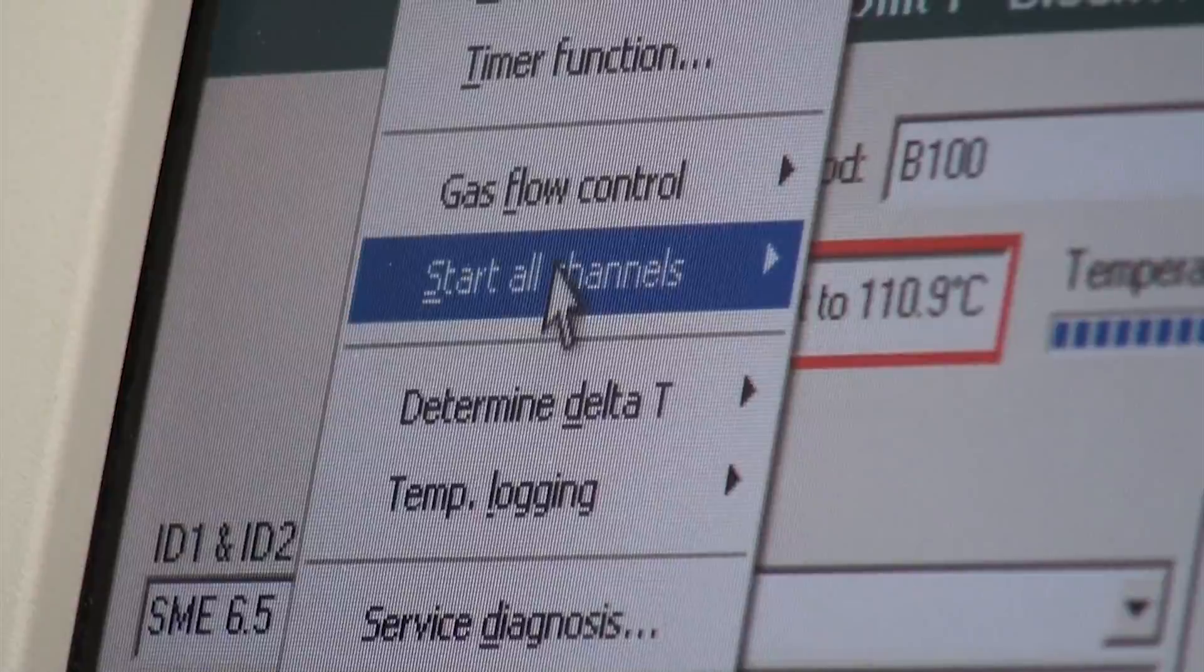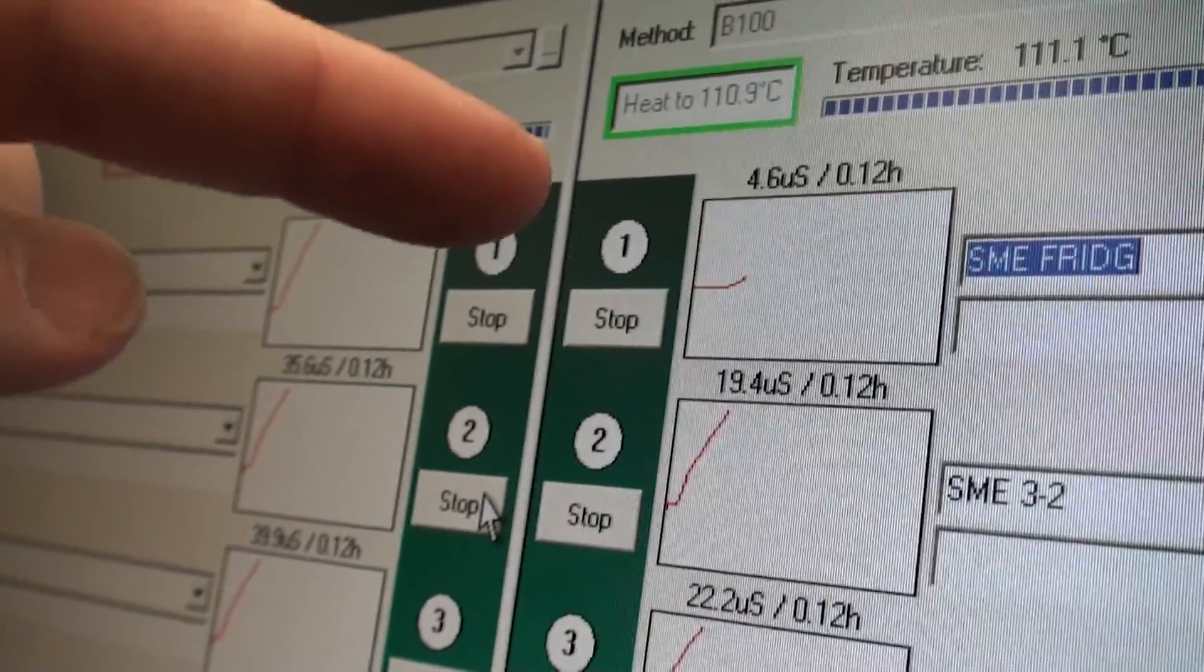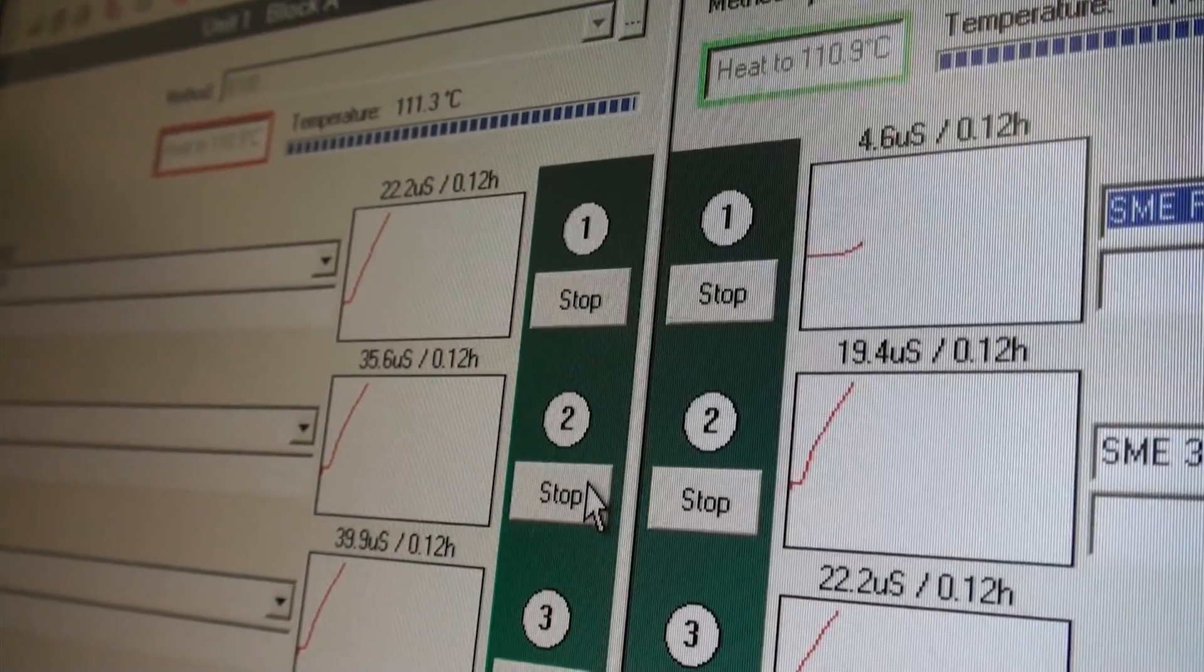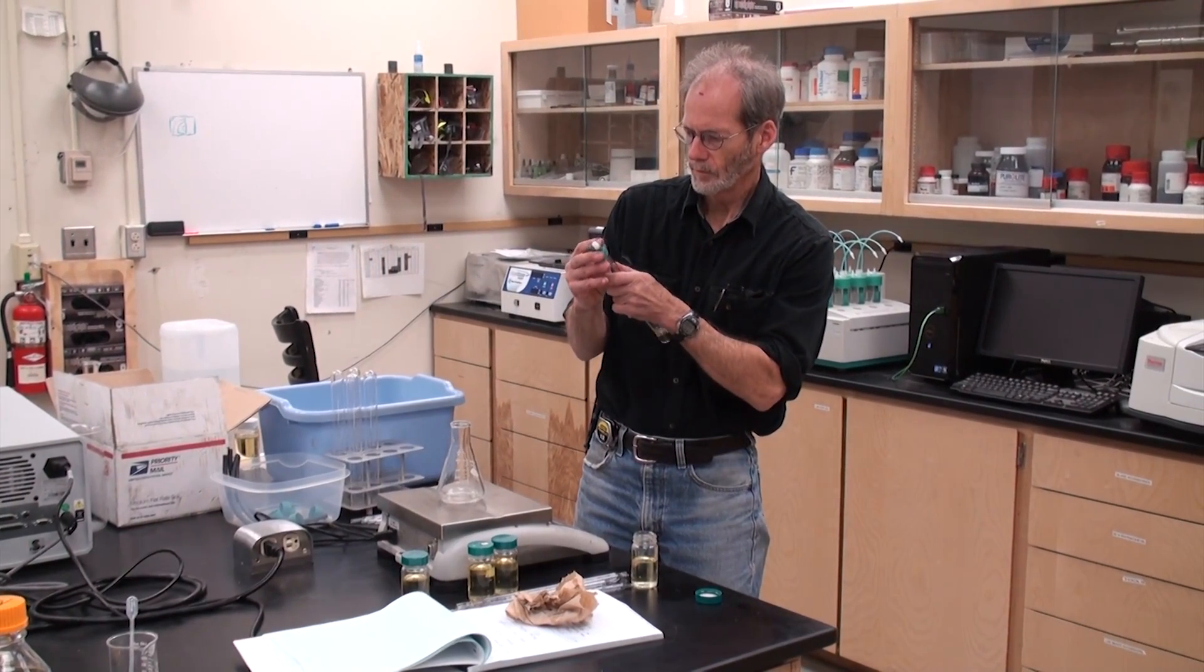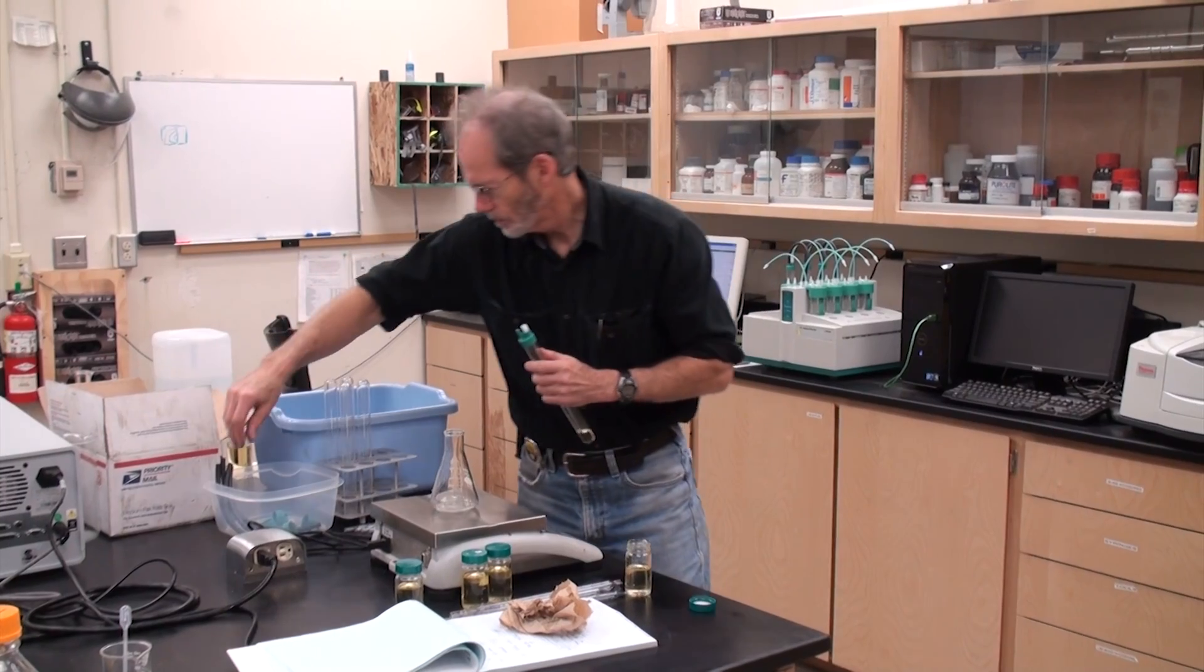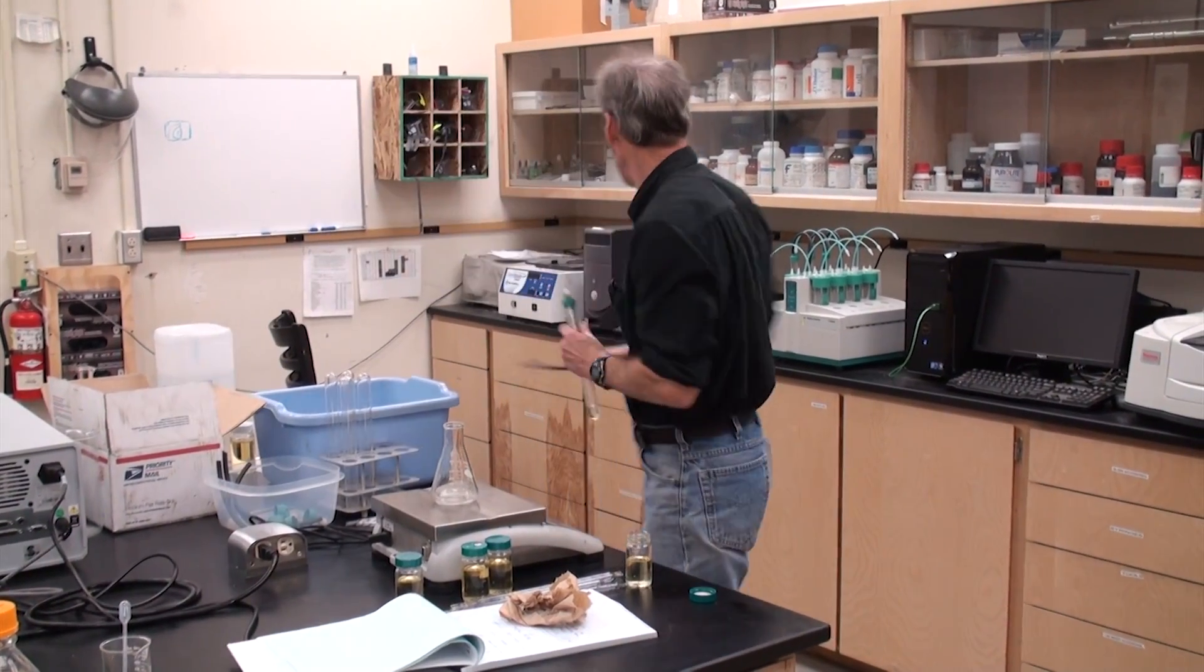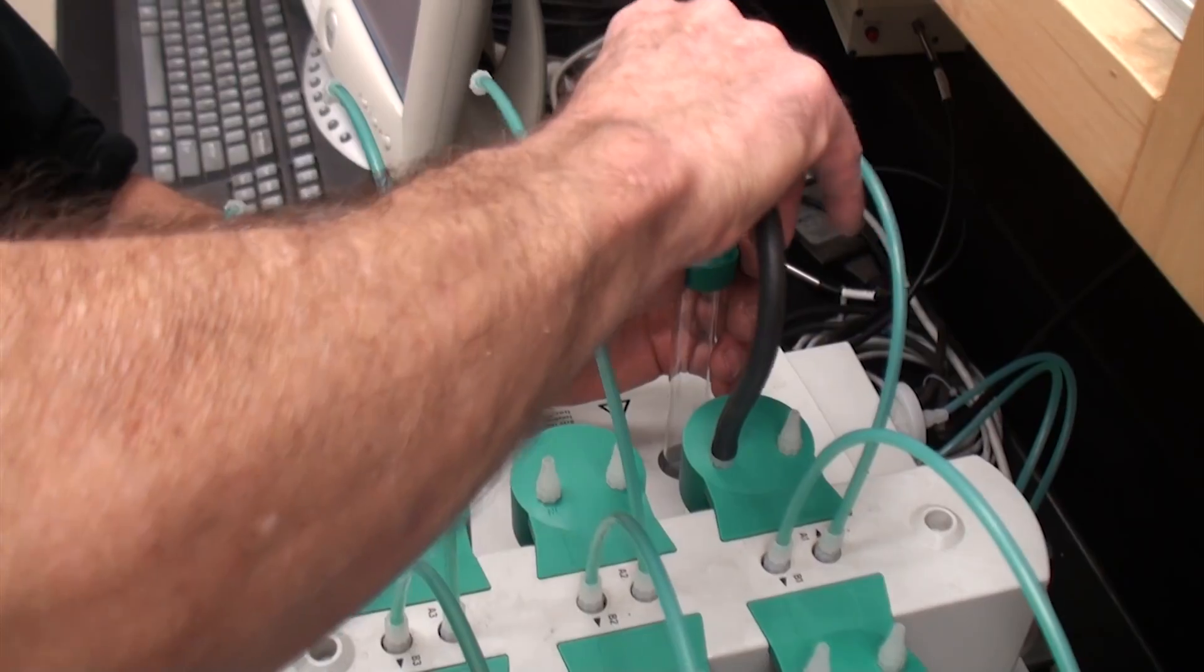One of the specs for biodiesel is oxidative stability index. The U.S. spec is three hours. So the sample needs to sit in there for three hours at that temperature with air being blown through it and still maintain its integrity.